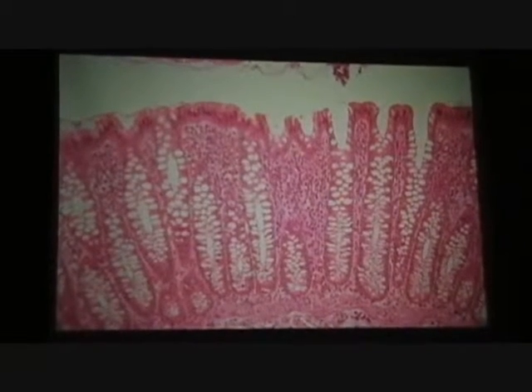And it really comes down to, is it esophagus? Is it stomach? Is it duodenum, ileum, or colon? Those are the compartments you're histologically responsible for. You've got it narrowed down when you're in those areas.